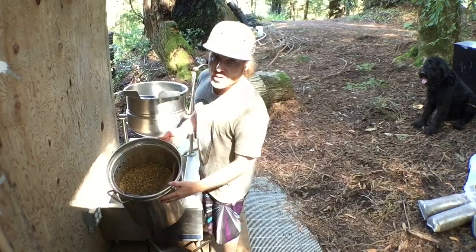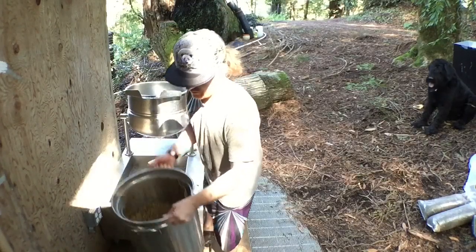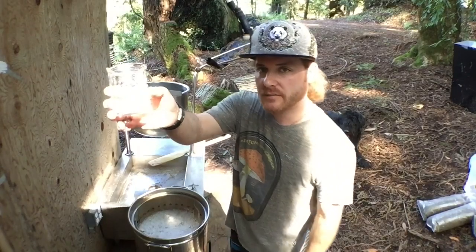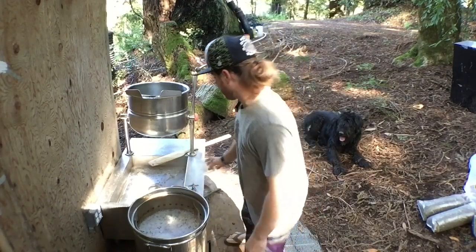So we're going to add a little bit more water to bring it up so we can boil it, and then we'll put it on the burner and boil it. Now that we have it filled up, we're going to add 10 more grams of gypsum, and we'll mix it up and turn it on.